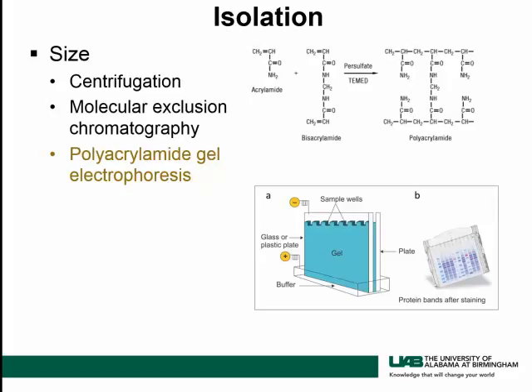Now, there are three things that are in play. There is the shape of the protein that will affect its movement. There is the net charge of the protein that will affect its movement. And then there's the molecular weight of the protein that will affect its movement.